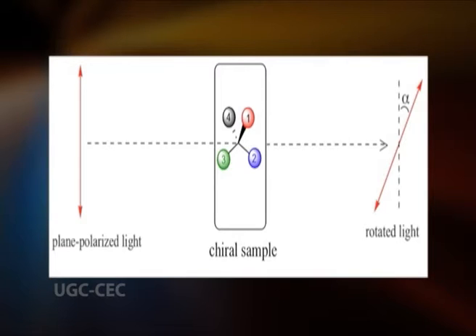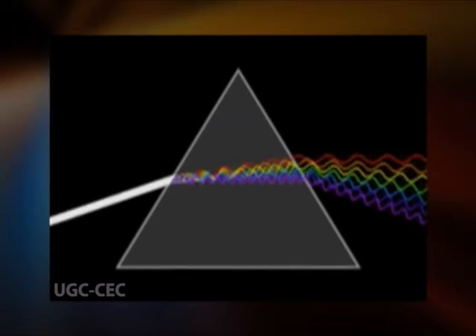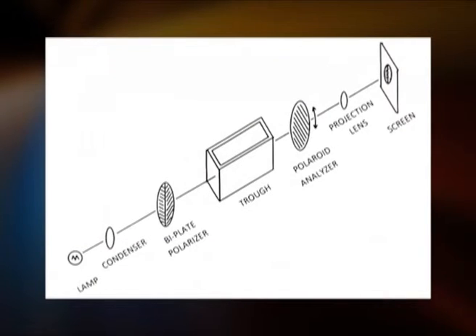Optical rotations usually are measured at just one wavelength, that is 589.3 nanometers, simply because sodium vapor lamps provide an especially convenient source of monochromatic light. Measurements at other wavelengths are less easily made without specialized instruments, with which relatively few labs are currently equipped.